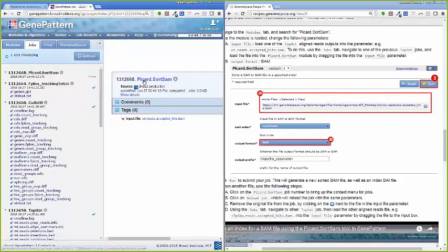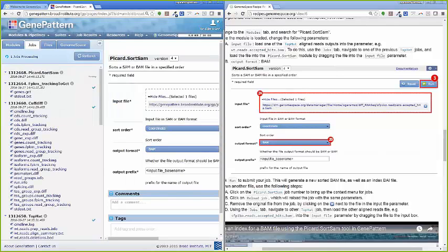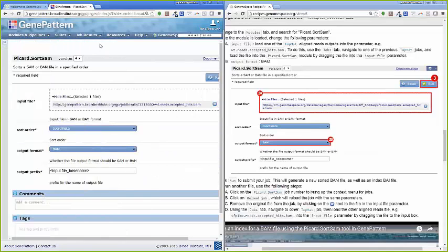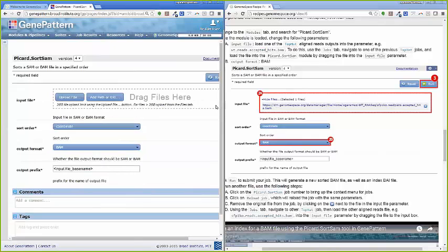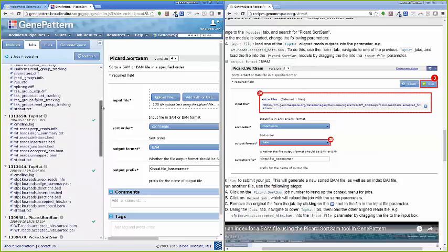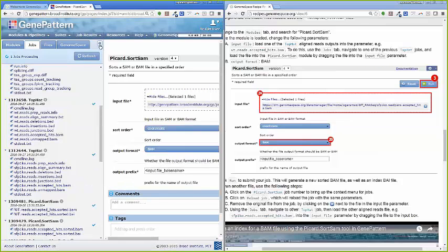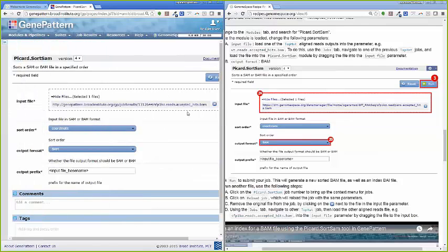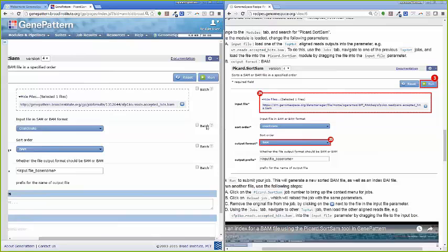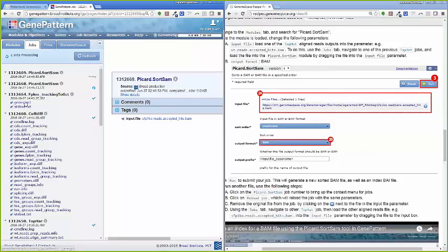for the knocked-out sample. The quick and easy way to do that is to click that job and click Reload Job. Here what we're going to do is remove this file and replace it with that SFP1KO accepted hits file. If we scroll down and find that, we have sfp1ko.reads.accepted-hits BAM. Again, the output format is BAM to match the input format. And then we can click Run. So now we have our genes.gct, and we're running our two modules for creating our index files.